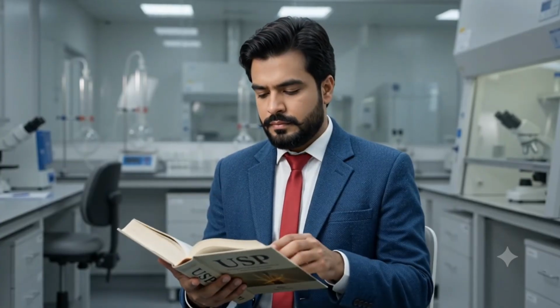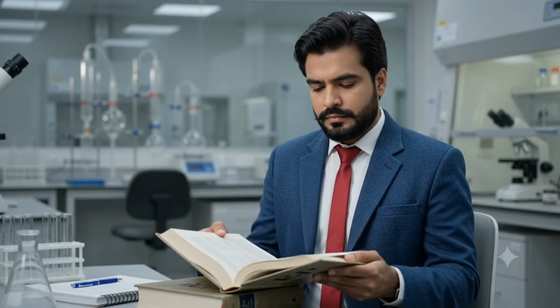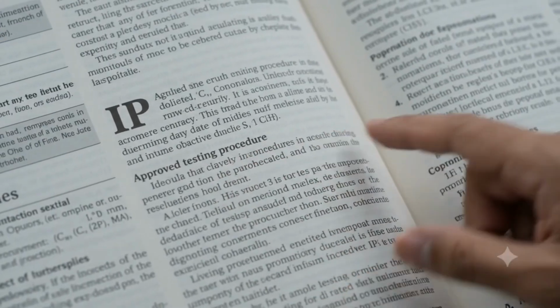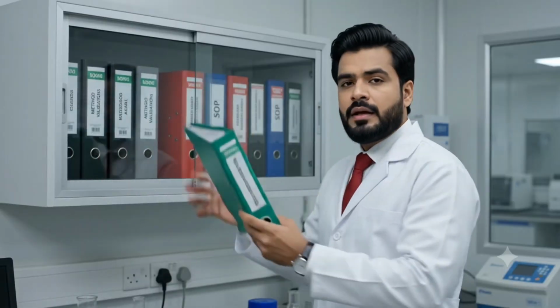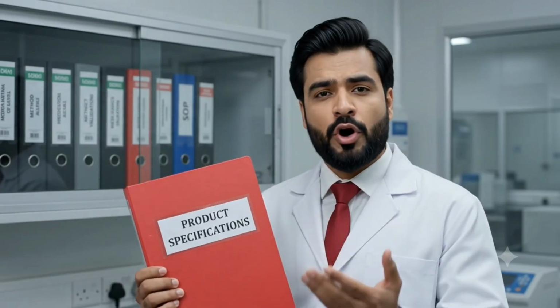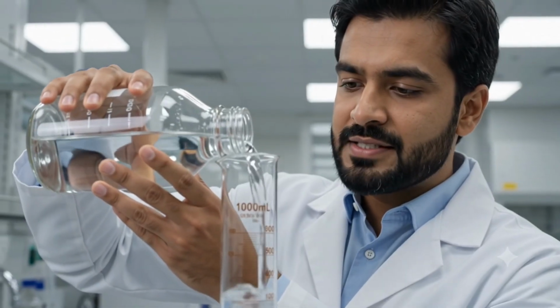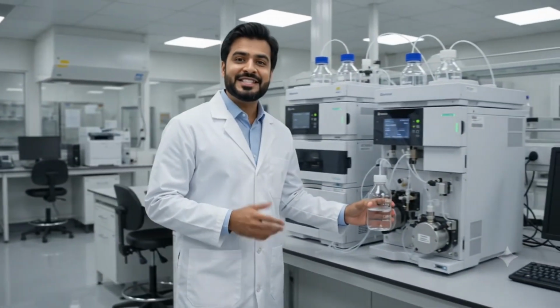Before touching any instrument, the analyst reviews the approved testing procedure. These procedures come from pharmacopoeias like USP, BP, EP, or IP. Standard operating procedures, known as SOPs, are critical. So is method validation. And finally, product specifications. Everything must be ready. We prepare the mobile phase, then dilute it with pure water. Now, the HPLC is ready to run.